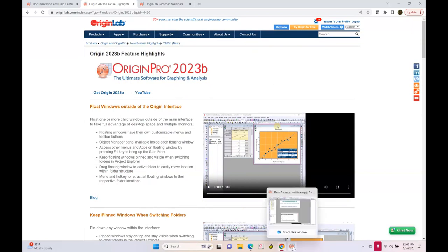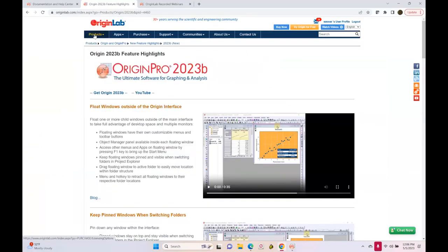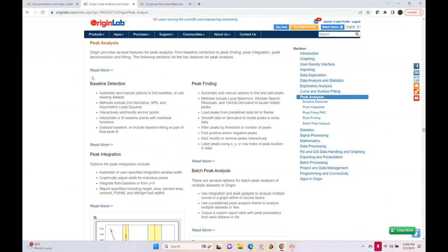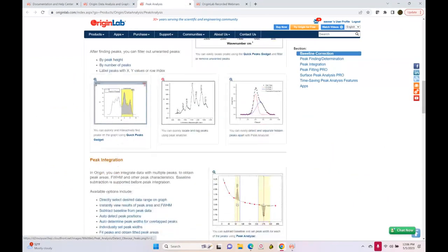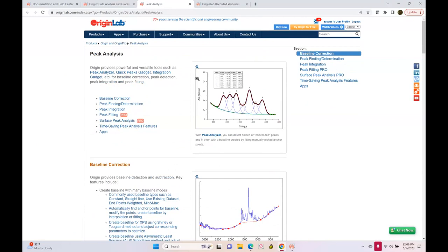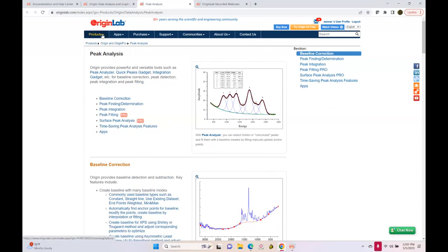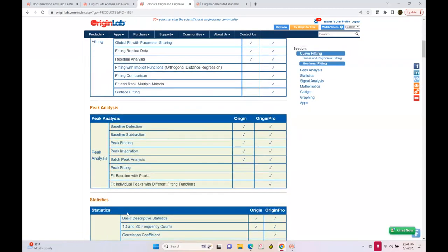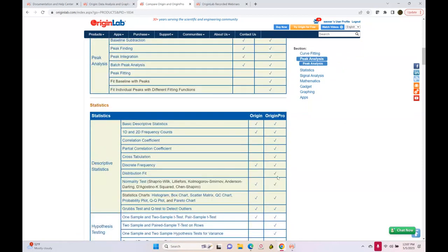Under the products page, if you click on Origin or OriginPro, you get to the main product page with an outline of all features. If you click on peak analysis, for example, there is a summary and a more detailed page on all peak analysis features. Keep in mind we have two products: Origin and OriginPro. Several peak analysis features are available only in Pro — similarly, advanced curve fitting, advanced statistics, and advanced signal processing are also available only in Pro. Under the products menu, there is an Origin versus Pro comparison table.